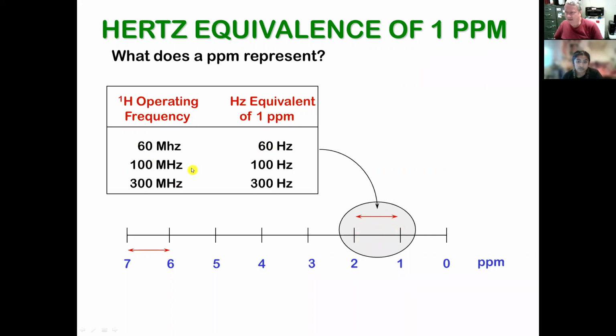Okay, and that's the purpose. At SF State, we have a 500 megahertz NMR. We have 2 of them, actually. Those are $500,000. You might be able to buy a 60 megahertz NMR on eBay for a couple $1,000s. If you really want your own NMR, maybe $10,000, I don't know. But these 60 megahertz NMRs are very old and kind of obsolete. Okay, good.